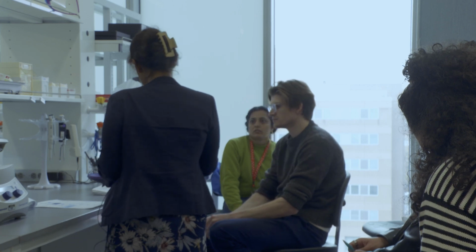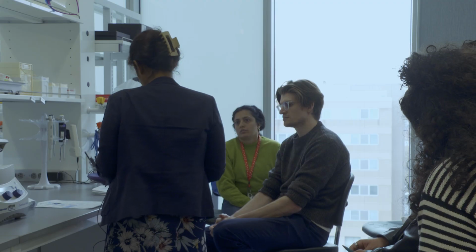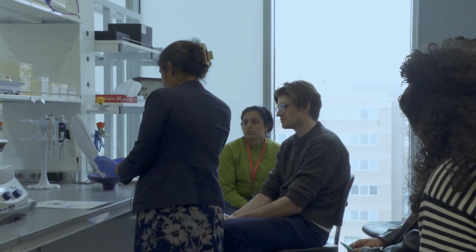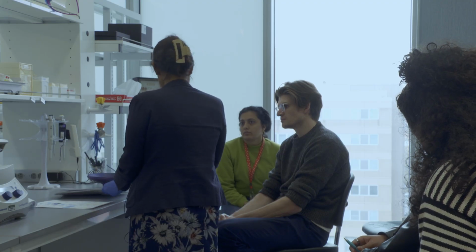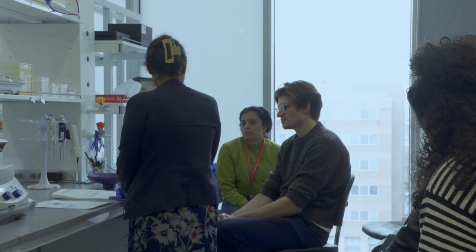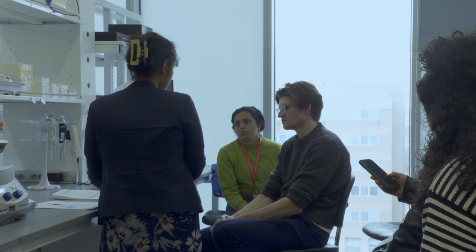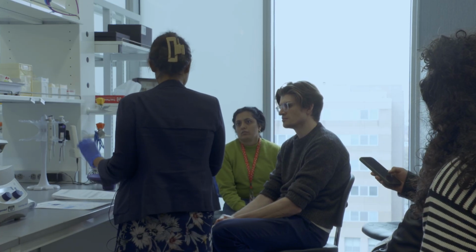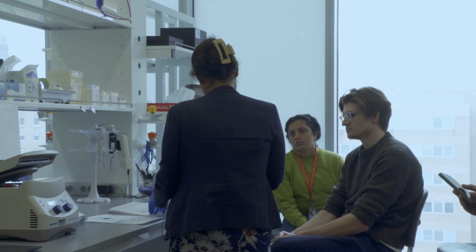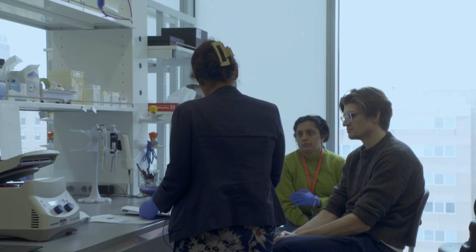But the next step would be our end prep, right? For end prep, let's calculate. It says at least we need 6 nanograms. Because we have so much contamination and everything, if we have 10 or 12 nanograms, let's just take that much of sample. Also the volume has to be matched. We have a specific volume for the sample, right? So you have to dilute it with water?